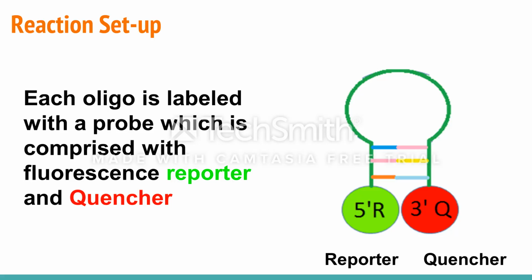When setting up qPCR reactions, you combine the PCR reagents, custom primers, the reporter molecule, and the quencher. As DNA is being replicated, it is tracked with the fluorescent reporter molecule and is quantitative during this process.